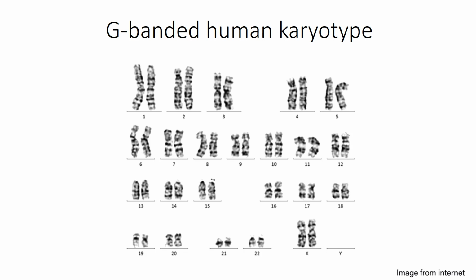The chromosome karyotyping is done in this way: chromosomes 1, 2 and 3, the metacentric ones, are placed in group A. Chromosomes 4 and 5 are placed in group B. Chromosomes 6 to 12 are placed in group C. The X chromosome is also part of this, but here it has been separated, which is why it is not shown.